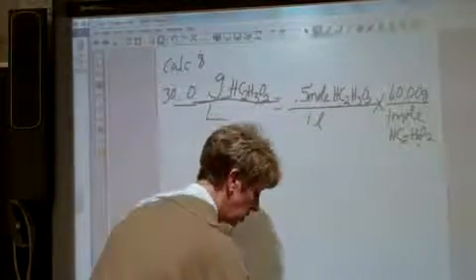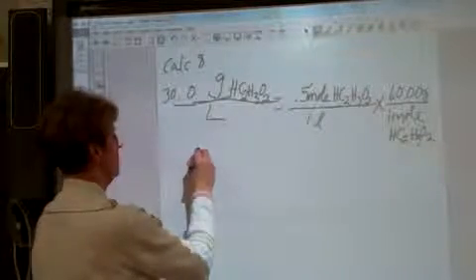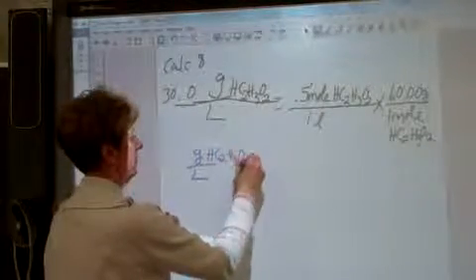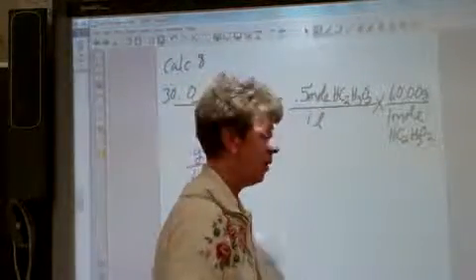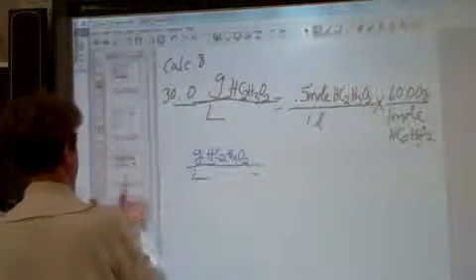Now, here's your job. Your job is to do that same calculation, but now use your molarity. So on the previous, from our data table, we said 0.9160.